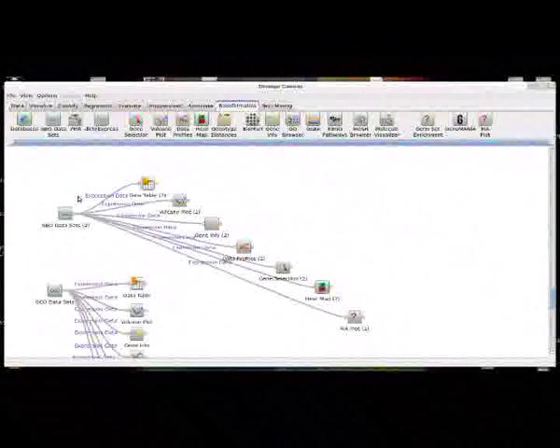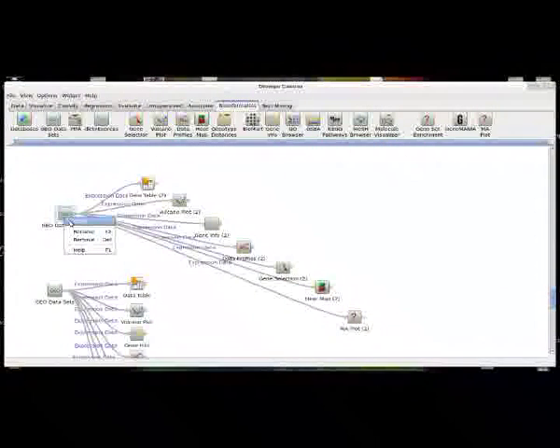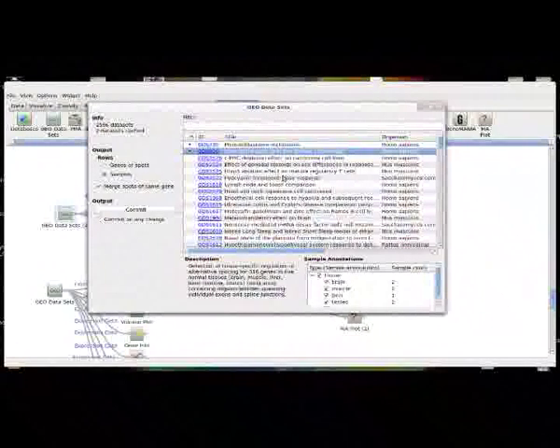So to start off, we'll be looking at this GeoDatasets widget, which is conveniently placed right up here. So what does this do? Well, this gives you access to about 2,600 different data sets that you can just click on one and hit commit, and it will download.